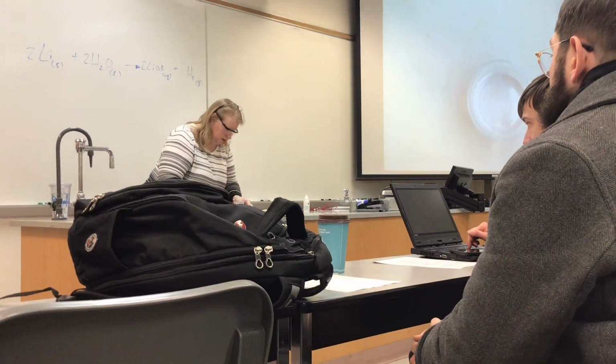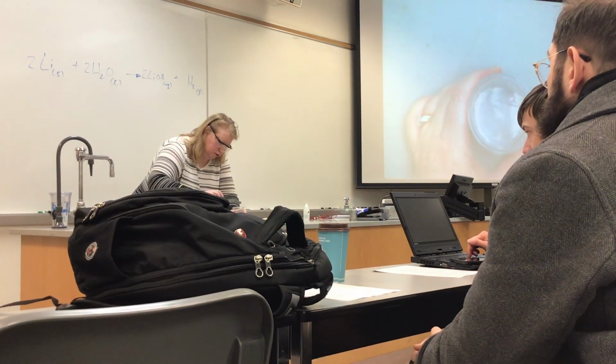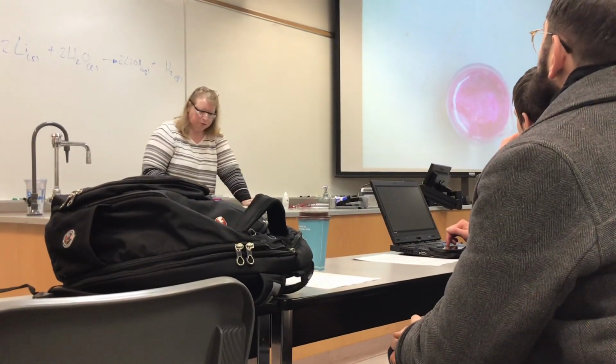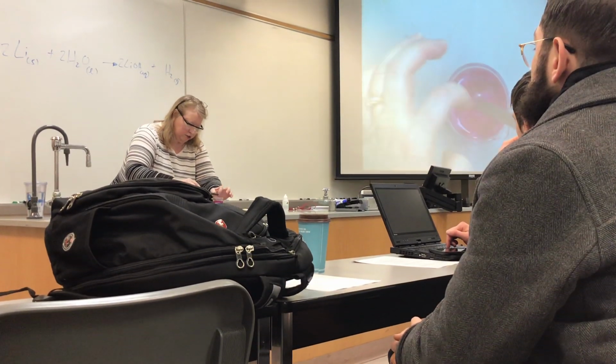Having a problem today getting this off the spatula. There we go. Sticking with the mineral oil. Maybe it'll break the beaker. Okay, there we go. What do you know about that reaction? Anything different about it? It's a little faster, right?